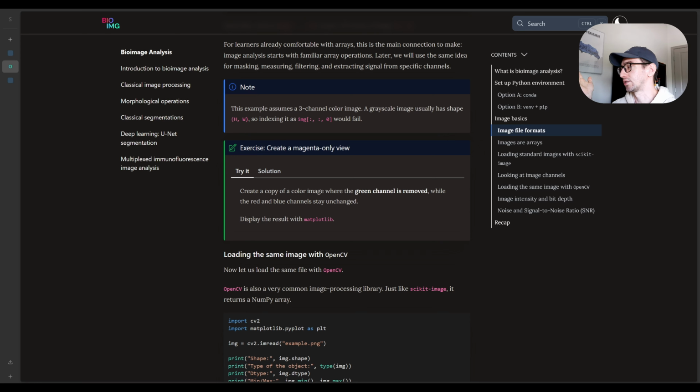There are other techniques built on generative AI, but the problem is that you change the image and you don't know what exactly happened. But if we want to do some bioimaging analysis, it is very important for us to be able to interpret what happened from one step to another. We will also adjust images and change something in them. But the key point is that we want to see what was before and what was after, and to be able to say whether it is fine enough, or whether we over-computed or over-processed something.